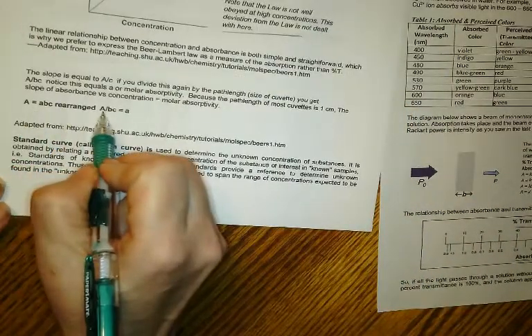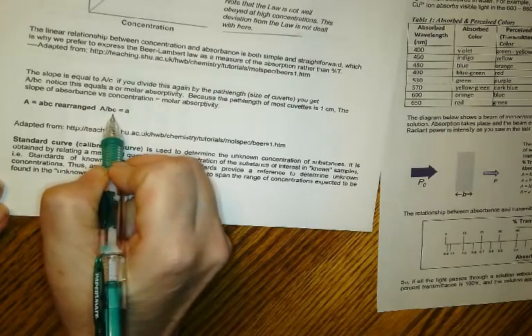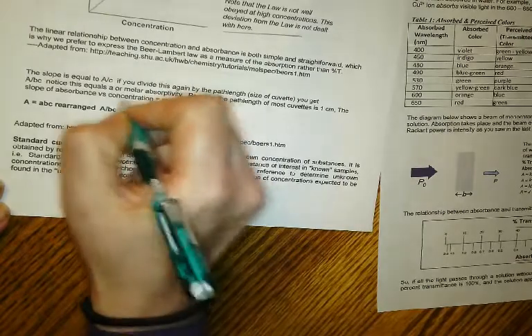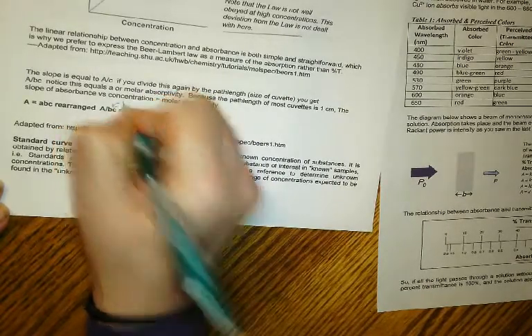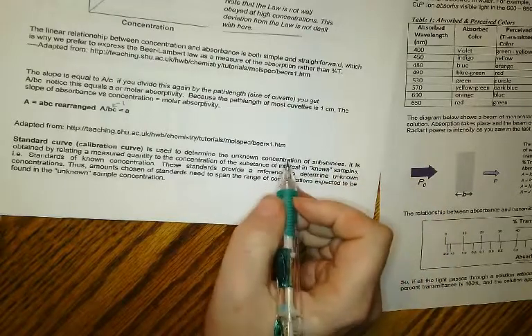And down here, I just rearranged this so you can see that absorbance divided by concentration equals molar absorptivity. This is our path length, and our path length is 1. So it works out like that, okay?